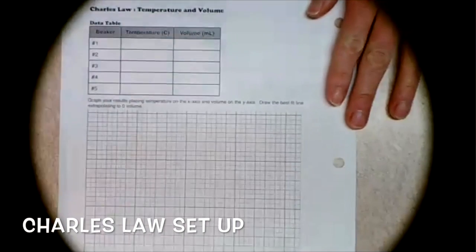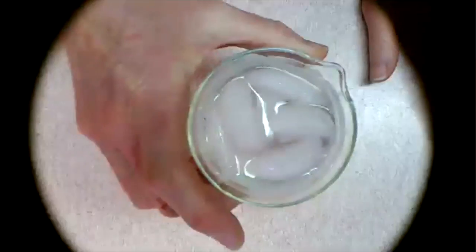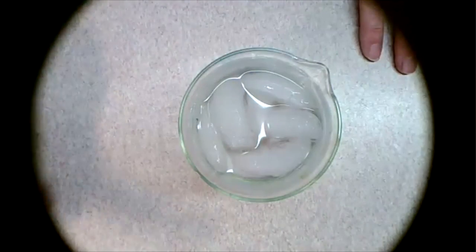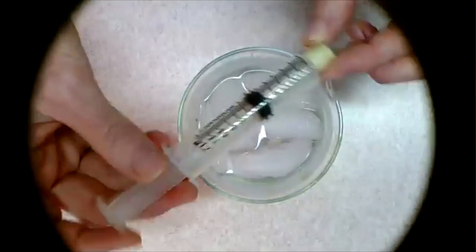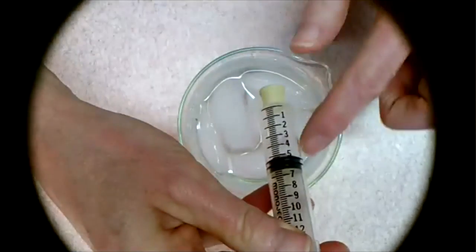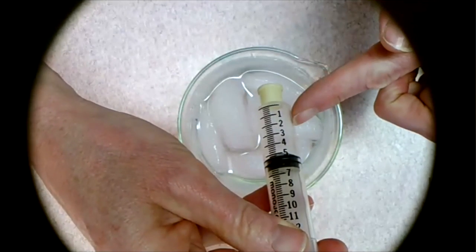Then you'll see Charles' law. Charles' law, notice, is temperature and volume relationships. So I have a set of 5 beakers. Here's the first one. Notice it has ice in it. And here is a syringe. I've trapped air in here. There's 5 milliliters of air.